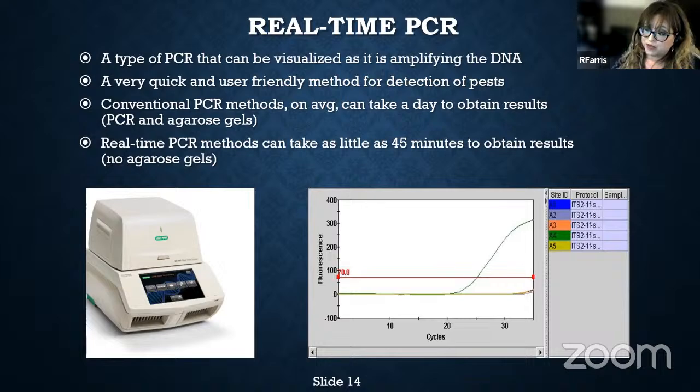For real-time PCR, not only do you add primers, you add an additional component known as a probe. A probe is just like a primer in the sense that it's a small sequence of DNA that hones into a certain region.